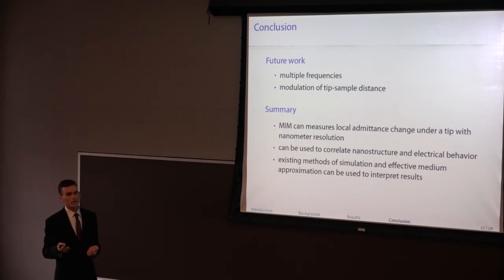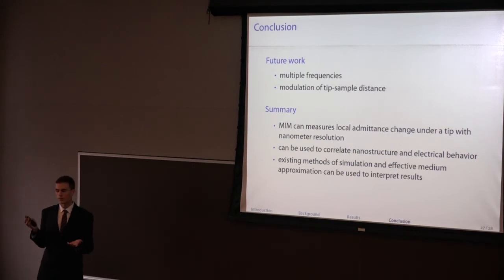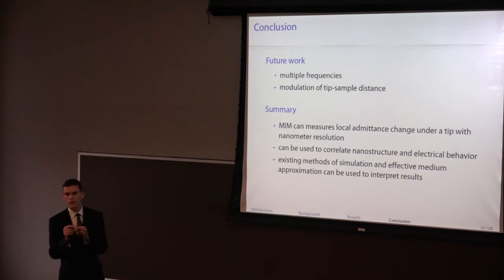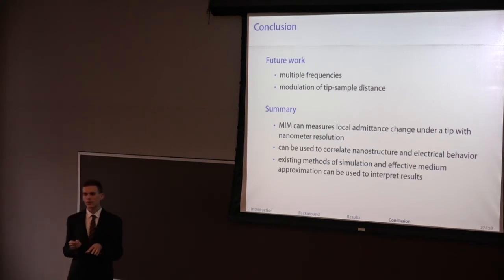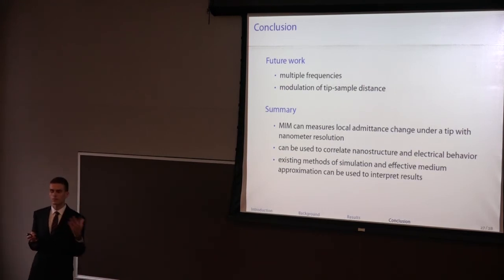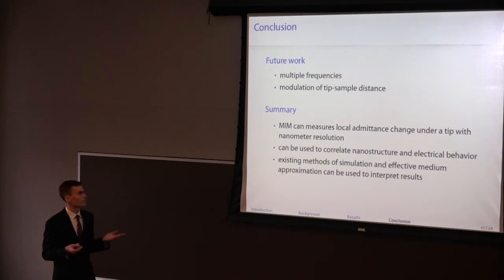But otherwise, just to summarize, we have this technique that measures the admittance. It measures a really high spatial resolution response to an electric field, and I'm hoping to characterize the structure and the electrical function of all these materials.